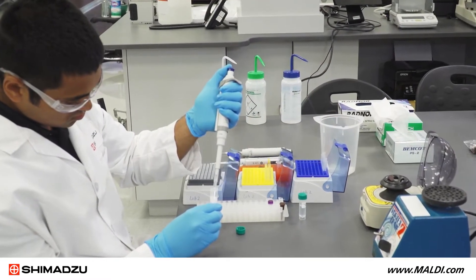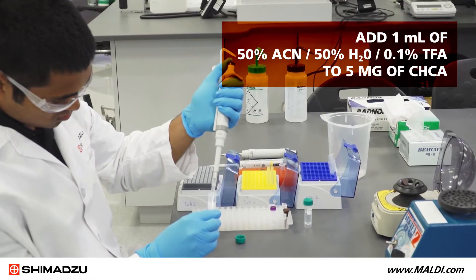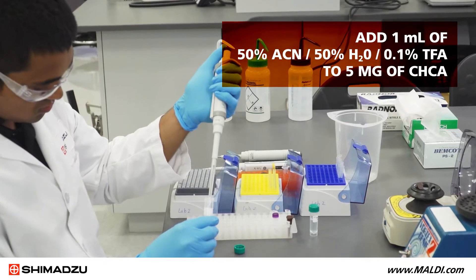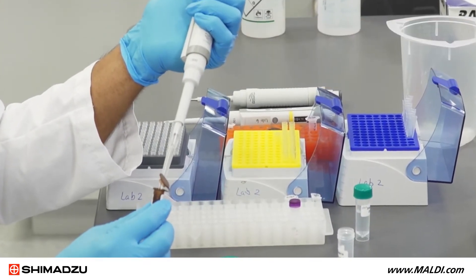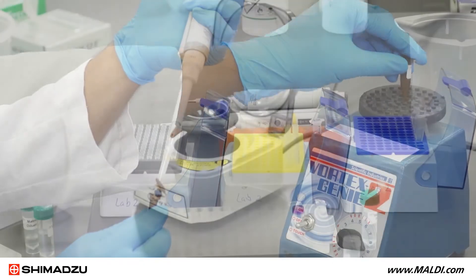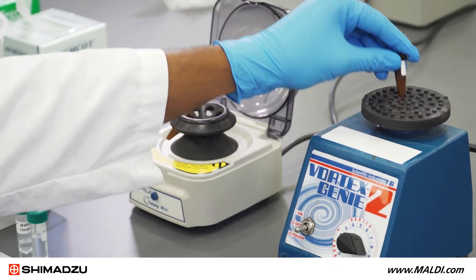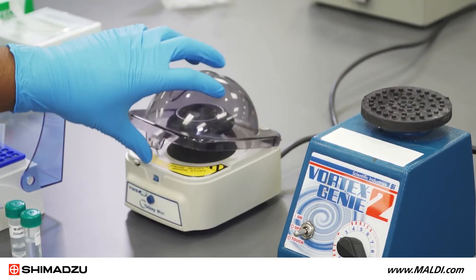To prepare the matrix solution, add one milliliter of an equal volume mixture of acetonitrile and ultrapure water with 0.1% trifluoracetic acid to 5 milligrams of CHCA. Vortex the solution to mix the matrix, then centrifuge to ensure any undissolved matrix particles are not accidentally pipetted during the next steps.